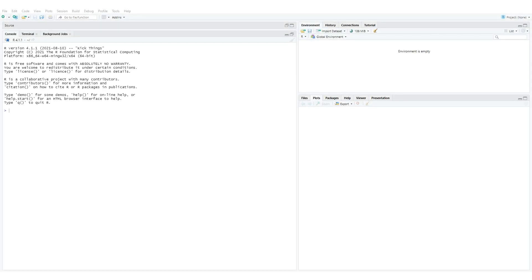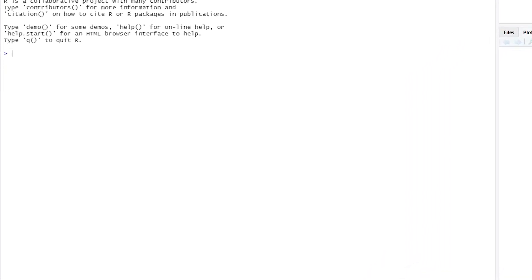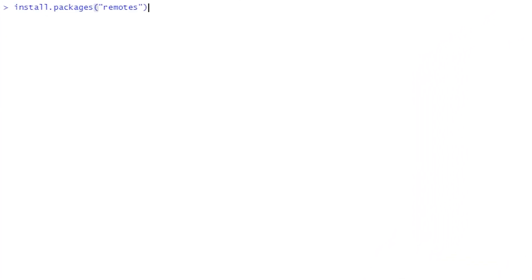First, open RStudio. We'll be installing this from the developer Johan's GitHub, so we'll use the remotes package in R to allow for installation of R packages from remote repositories. First install remotes with install.packages remotes.